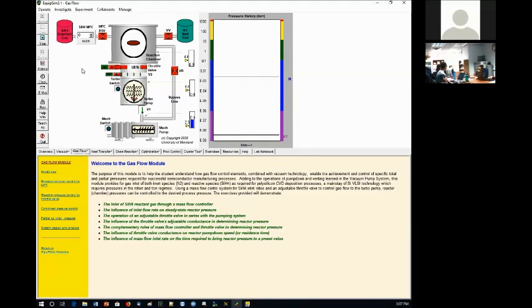All right, now we will either make it a plasma chamber and make it a plasma enhanced chemical vapor deposition, or just an LPCVD. To do that, we need to flow in some gas. We are going to flow in 100 SCCM. But this doesn't really send the gas yet. So enter 100 there and then open this valve here, of course. That is not a valve, that's a mass flow controller, by the way.